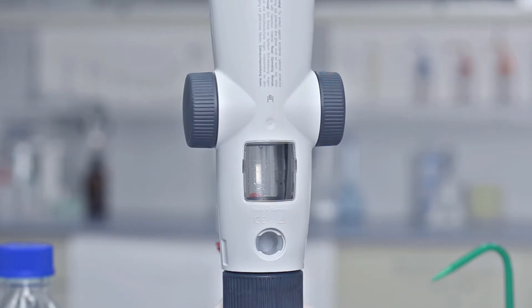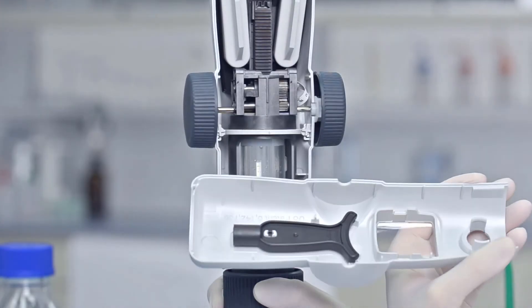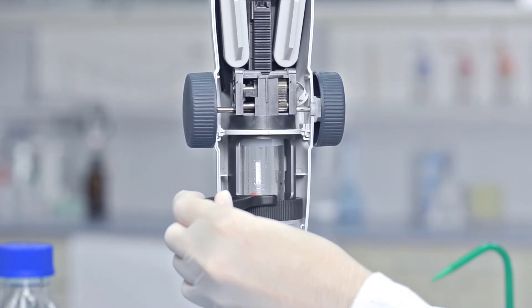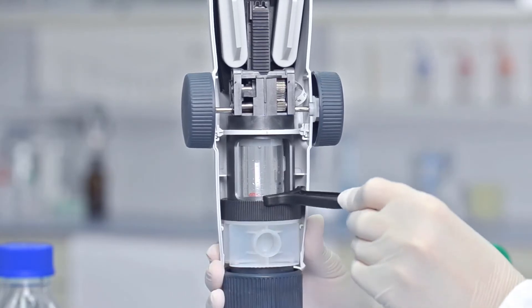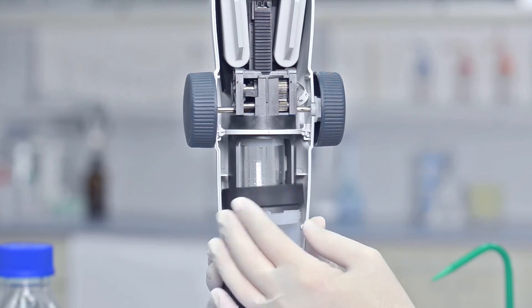Unscrew the air vent cap and open the housing. Remove the mounting tool from the rear housing and use it to loosen the safety ring on the dispensing cartridge. Then unscrew it completely by hand.